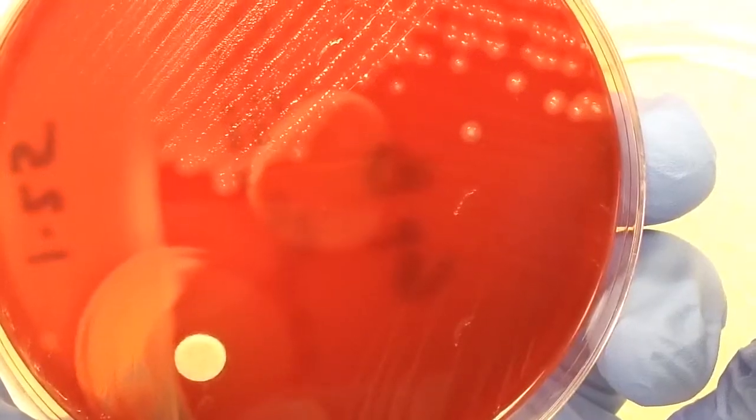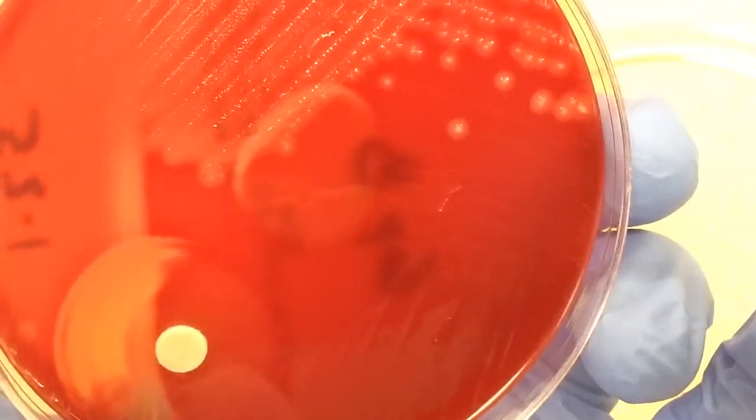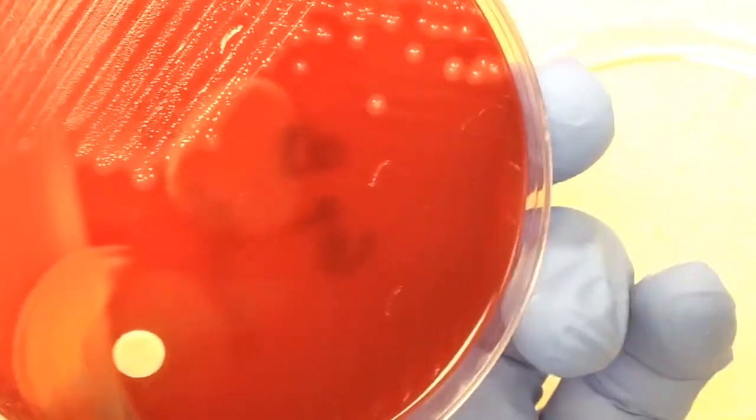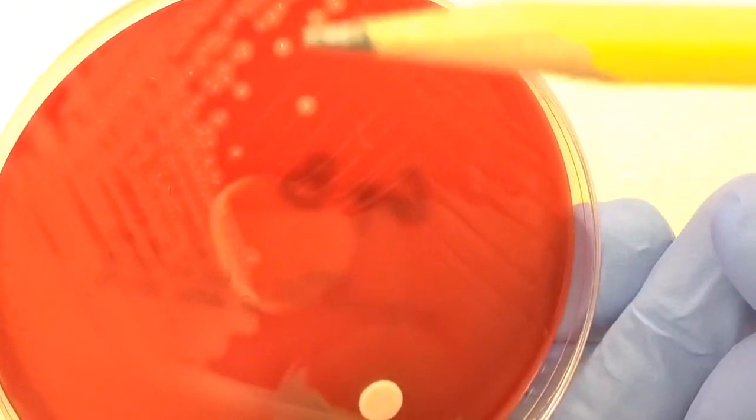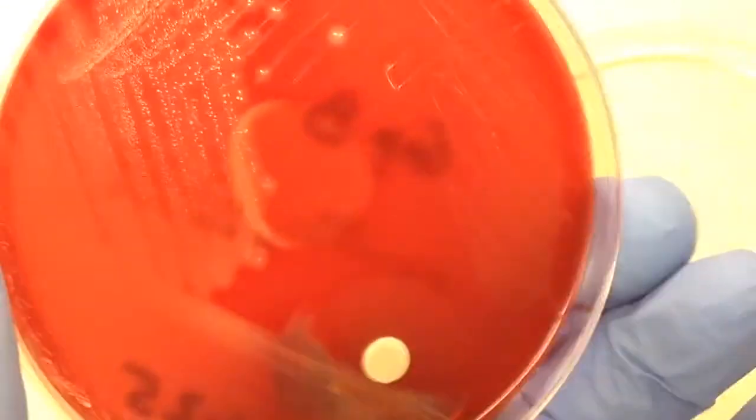Now group B, or Streptococcus agalactiae, is beta hemolytic. It's not as beta hemolytic as for example, Strept pyogenes group A, but you can definitely see here this halo of clear hemolysis around the colonies.